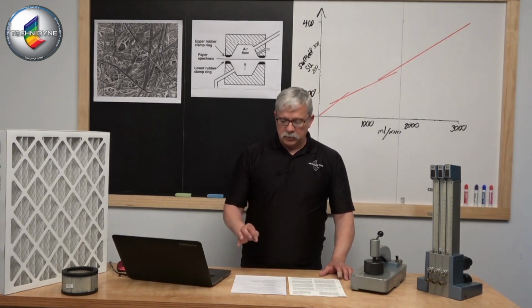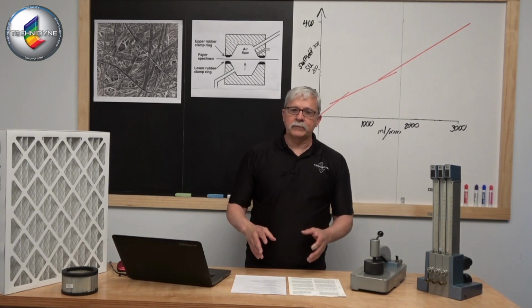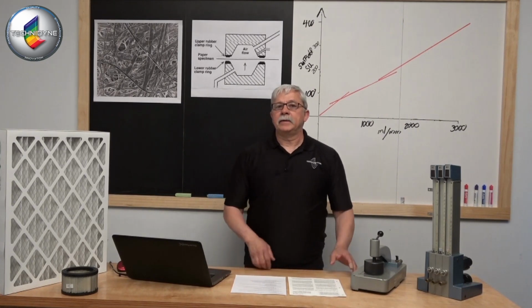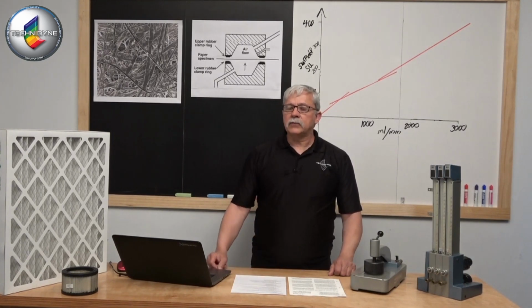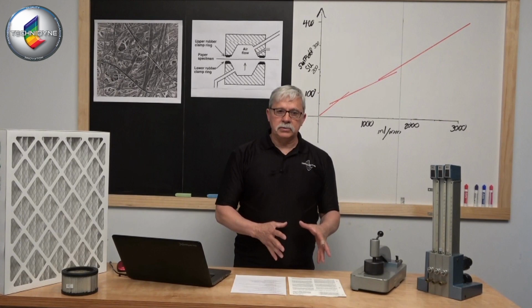They had produced a 1.5 inch orifice diameter, a 2.25 inch orifice diameter, and a 3 inch orifice diameter, again mainly to try to accommodate the wide range of products that were available at the time. Certainly those products are maybe even expanding today. So utilizing a different orifice diameter will help you to use this instrument for a wide range of products.